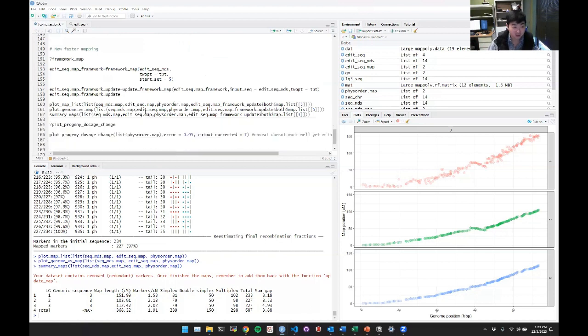As y'all saw earlier, mapping can sometimes take a while. With this small of a data set, it actually maps pretty fast, but for collaborators and even ourselves, if we allow about 10% missing data, we can have anywhere between 1 to 2,000 markers.